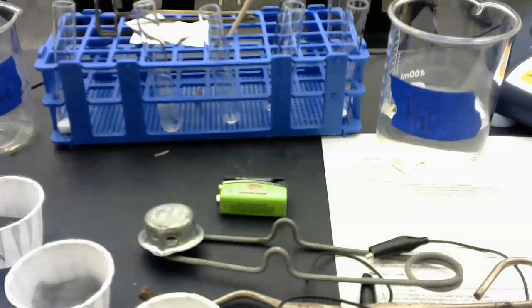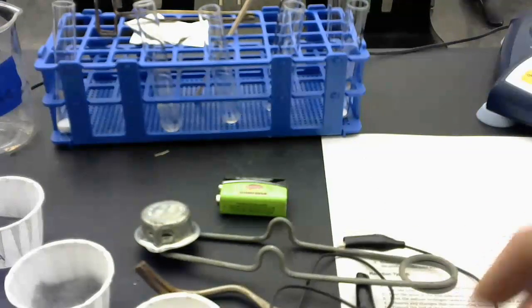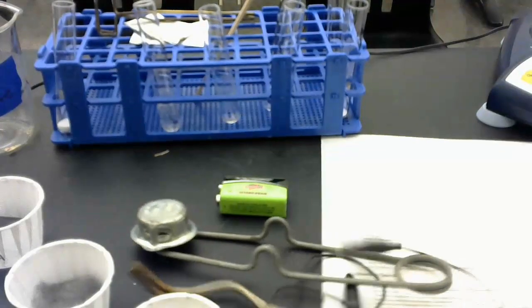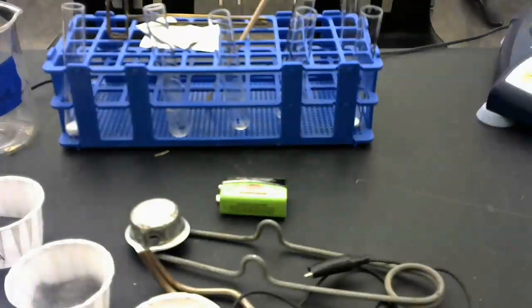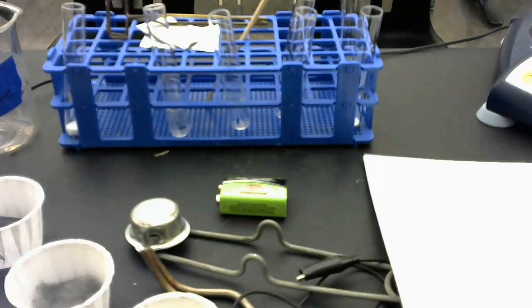You're also going to have your lab handout in front of you. That's going to be at the lab station for you, and it's going to give you instructions to the lab, and also the procedures for each step. So that's going to be right here, and that's going to be at your lab station.